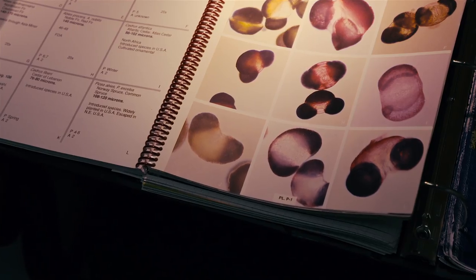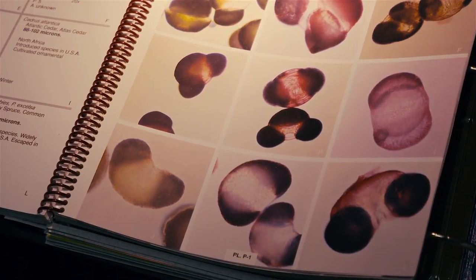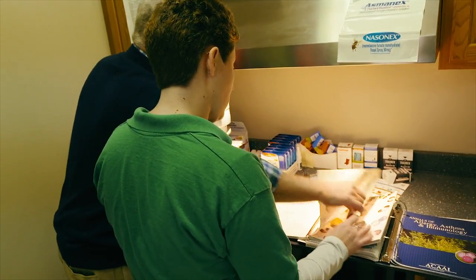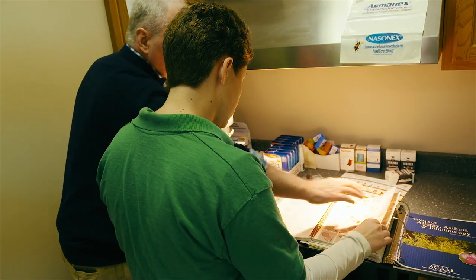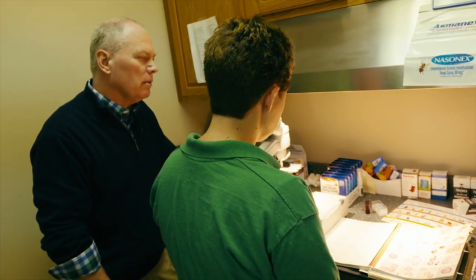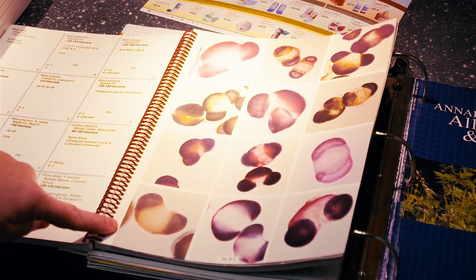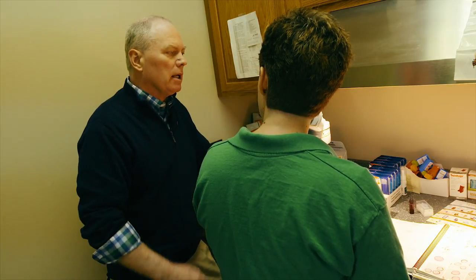Early in the season, we'll see some pine. It can be mixed with other pollens as well. This particular one only has the one I zoomed in for you so you can see. But looking through this book, you can page through, there's a number of different pollens that are available. So here's some other ones: alder, and oak, some maple with little horns, birch. And there's grasses and weeds. For instance, this is more like a ragweed pollen. So we combine what your skin tests show, your symptoms, the timing of your symptoms, and what we see on the scope to figure out what kind of outdoor allergens.